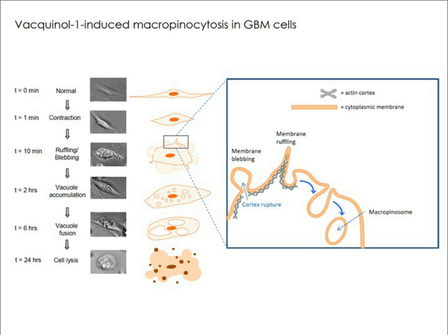So what you see here is how an image-based phenotype profiling approach, using a system that we have here, could identify unique properties or acquired vulnerabilities of cancer cells which have stem-like features isolated from these patients. So this is one exercise we did.